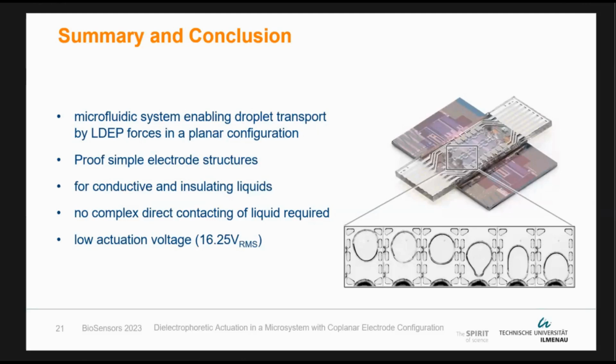And to continue with this, I want to move on with more open fluidic systems, so not with such very strict fluidic dimensions, but just to have an open system to demonstrate droplet transport, droplet mixing and merging, and other basic fluidic operations on this platform.